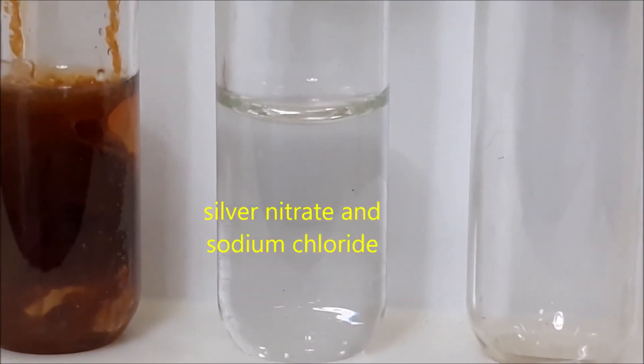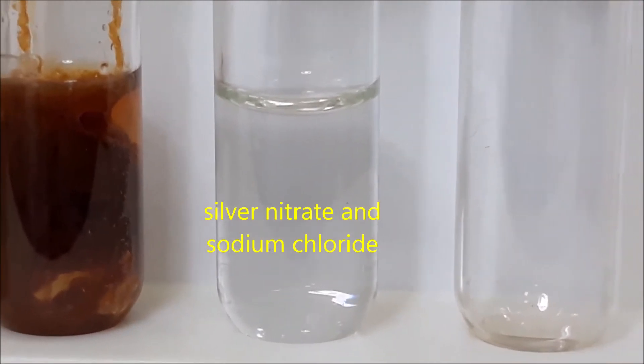For test tube number eight, we have silver nitrate and sodium chloride.